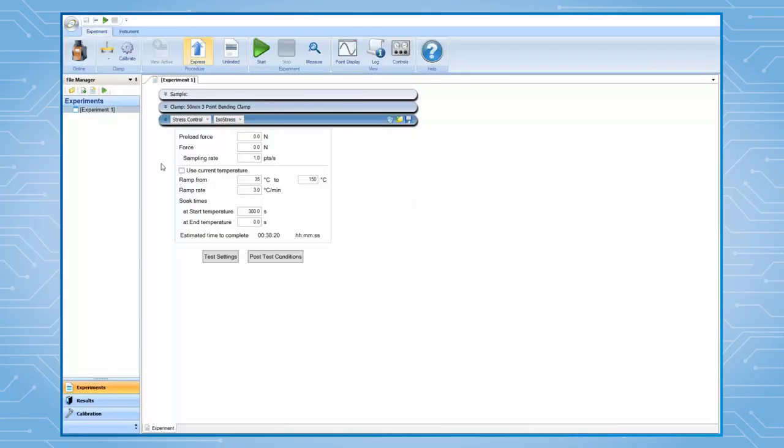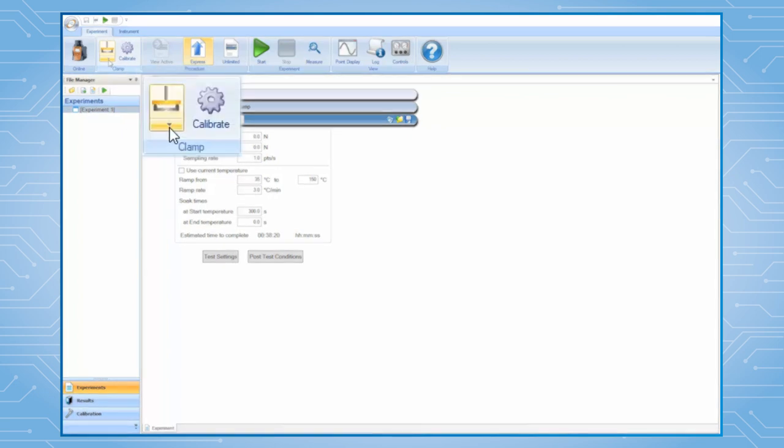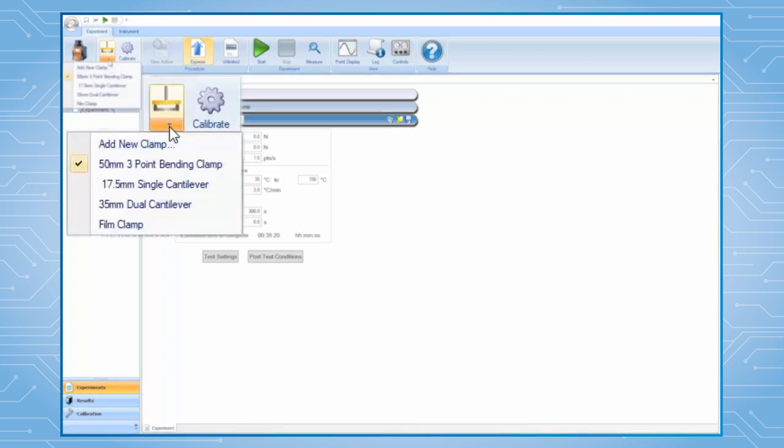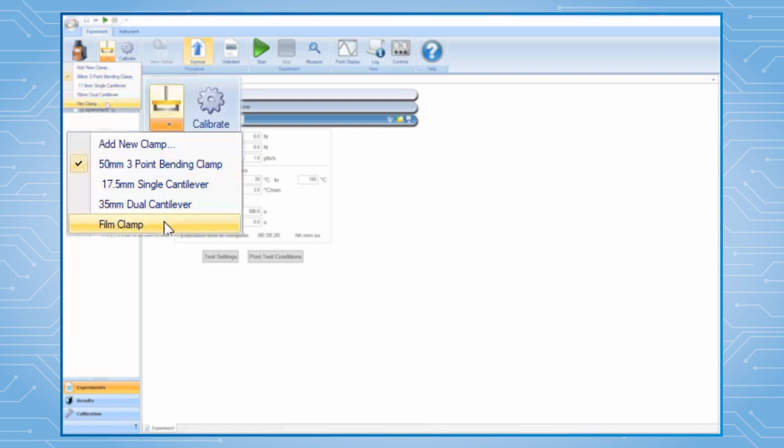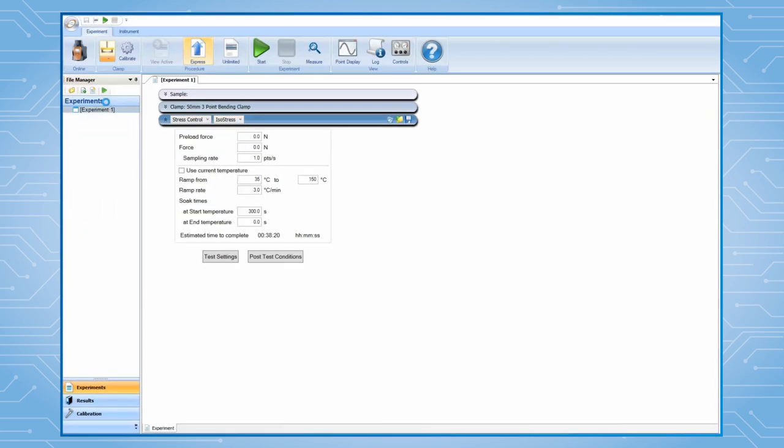Open TRIO Software and connect it to a DMA-850. Under Experiment, click on the arrow under the Clamp icon. Then, from the drop-down list, select the name of the clamp you want to install and calibrate, for example, the tension clamp.